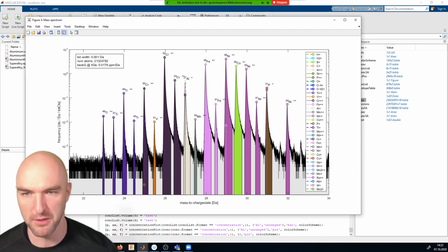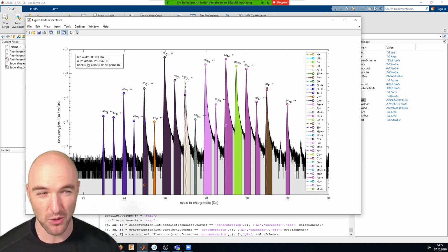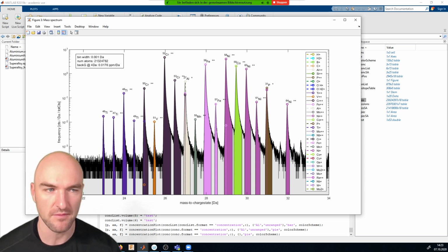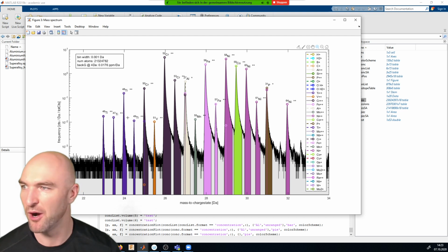Actually, for concentration plots like proximity histograms and 1D concentration plots, there's only one instance where I know that's been done, and that's Andy London working together with the guys from Oana Correa's group in Aachen, not Bochum, Aachen. They used a concentration calculation program that did all the deconvolutions. Andy, can you say something about that? I hope I described it correctly.